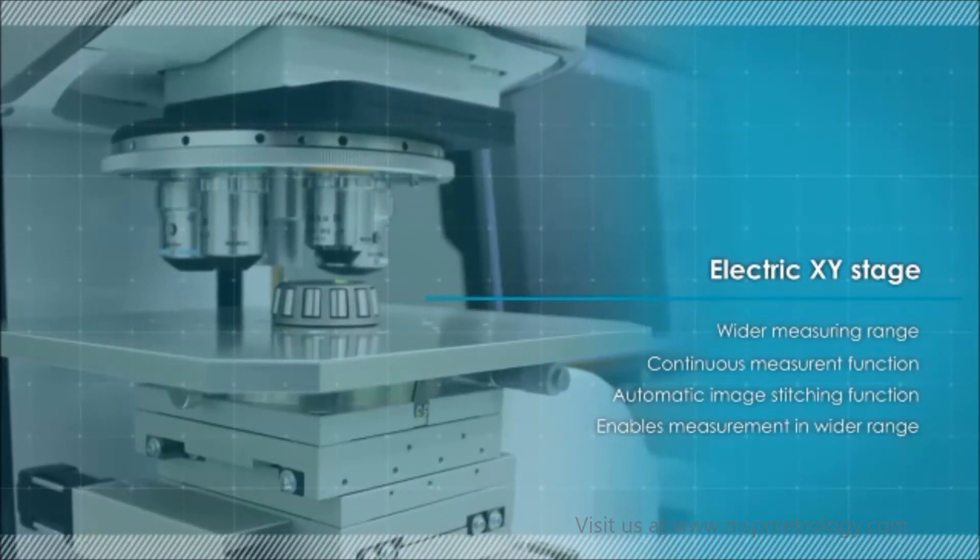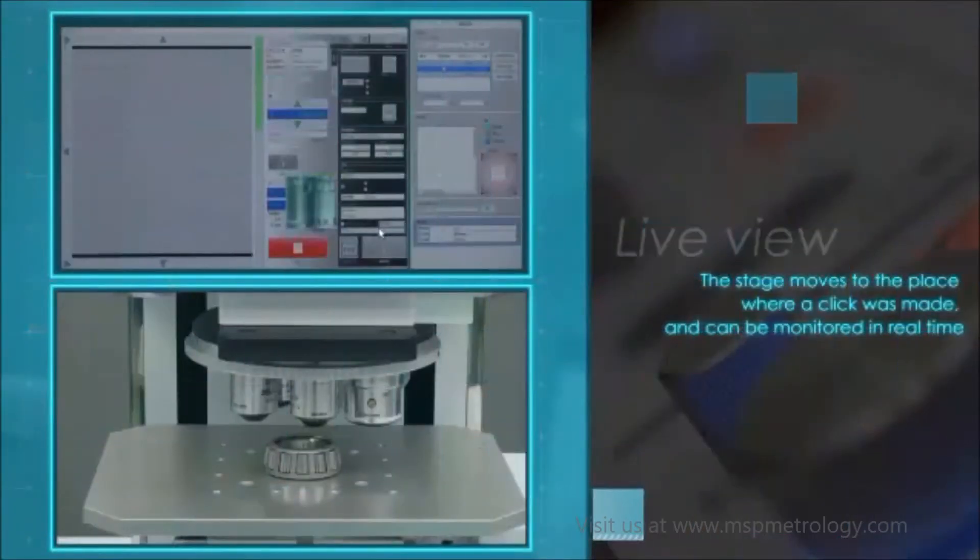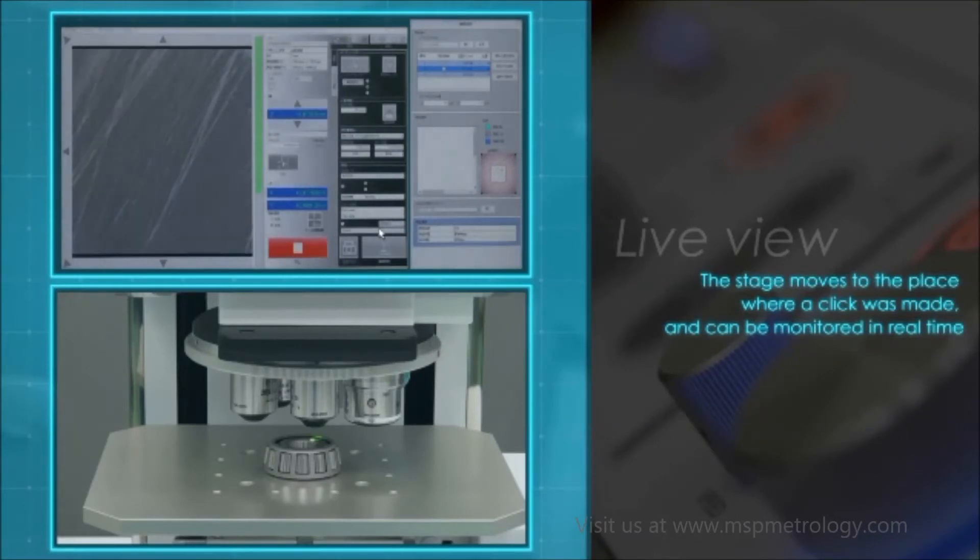This shows an actual continuous measurement. The stage moves to the place where a click was made and can be monitored in real-time.